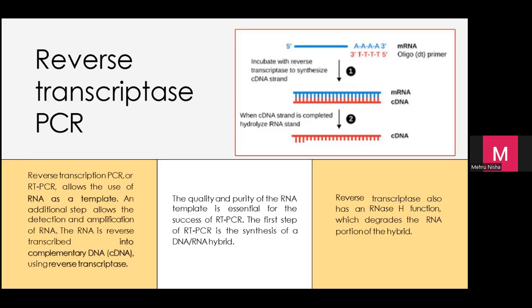Tapi RNA, nak kerja dengan RNA ni, it's very sensitive. RNA is single-stranded and they tend to degrade very fast. So RNA, if you want to work, you have to be very careful. You have to use RNA cleanup kit and so on. So that is the difference.